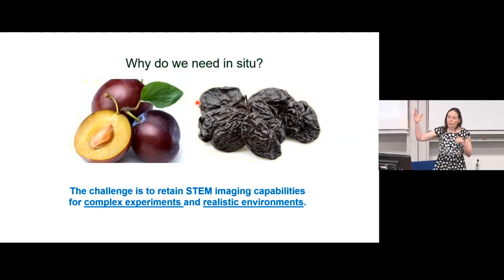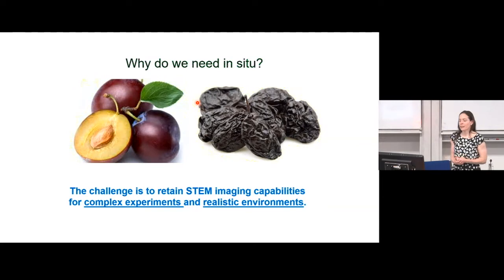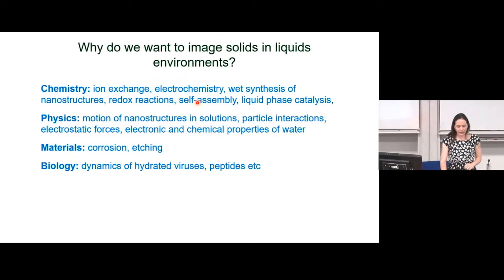So we have to be careful. When we are analysing to discover what makes the best possible catalyst, and we put it into the microscope, we come back and tell the chemist who has created it what they've developed. But in order to investigate it, we put it into the high vacuum of the electron microscope, whereas actually what they're using it in is a real hydrated environment, and it has a potentially different surface structure.